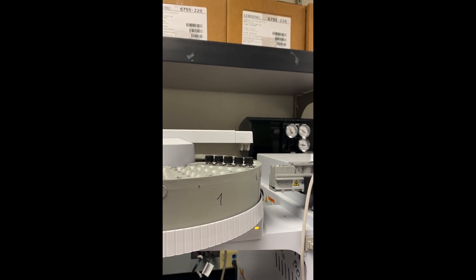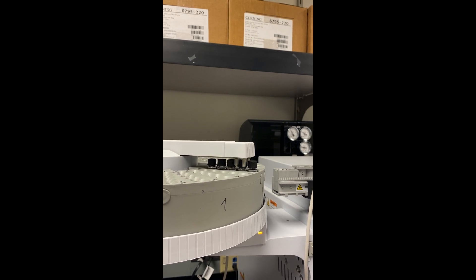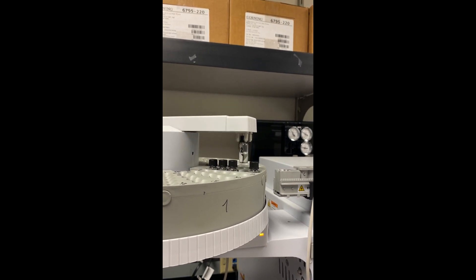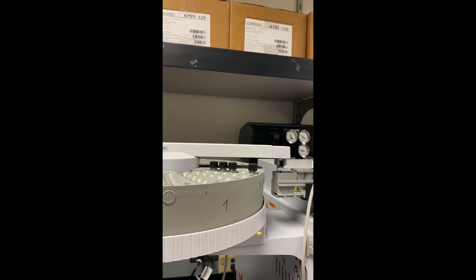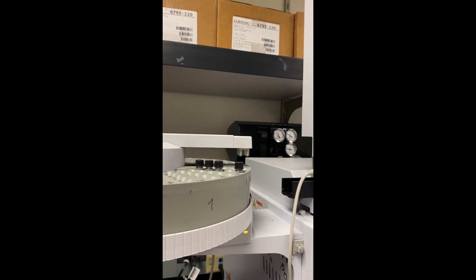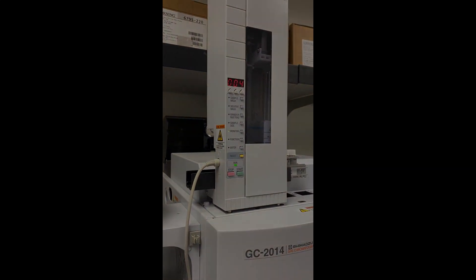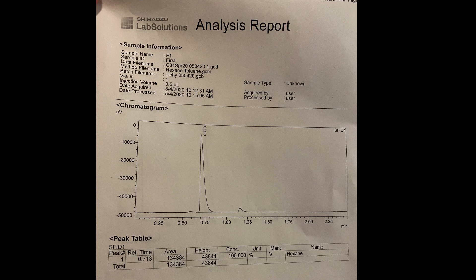The instrument uses a robotic arm to inject a sample into the injector port. Here, the injection sample size is 0.5 microliters. Not only can the computer print out the chromatogram, but it automatically prints out a table containing the following data: retention time in minutes for each peak, area under each peak, and percentage of the total area.